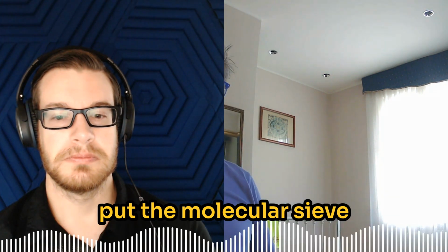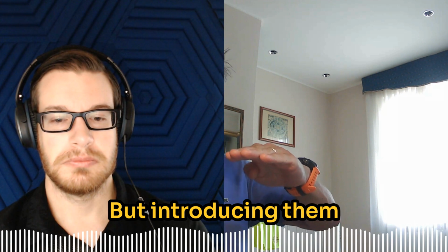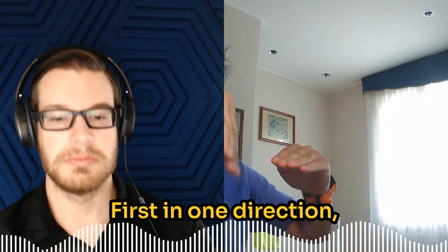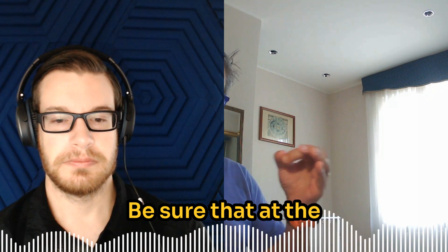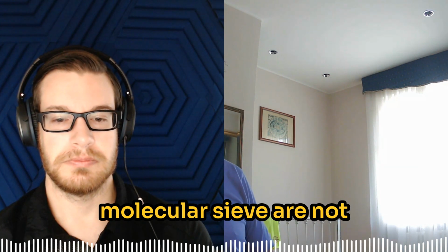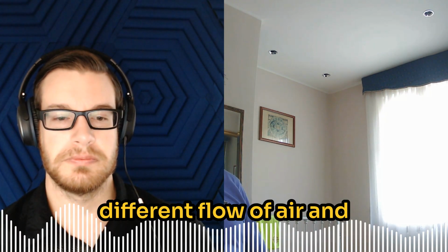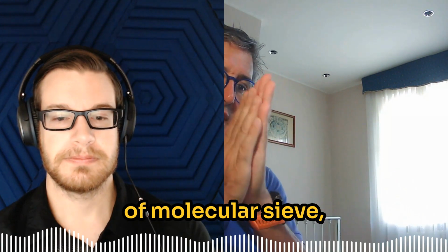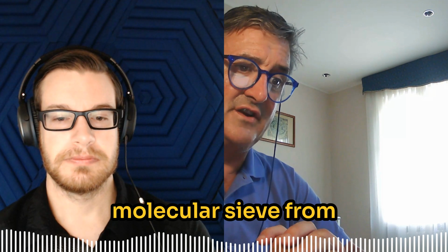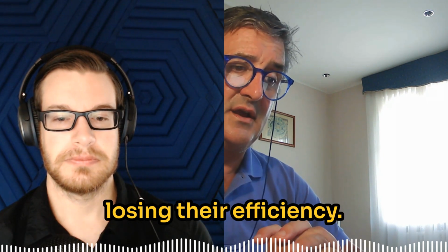to put the molecular sieve inside the column, introducing it in different directions. First in one direction, after in another, making vibration. Be sure that at the end of the packaging, the molecular sieve is not moving inside due to the different flow of air and nitrogen into the column. In this case, we prevent the movement of molecular sieve, we prevent the molecular sieve from generating powder, and then we prevent the molecular sieve from losing its efficiency.